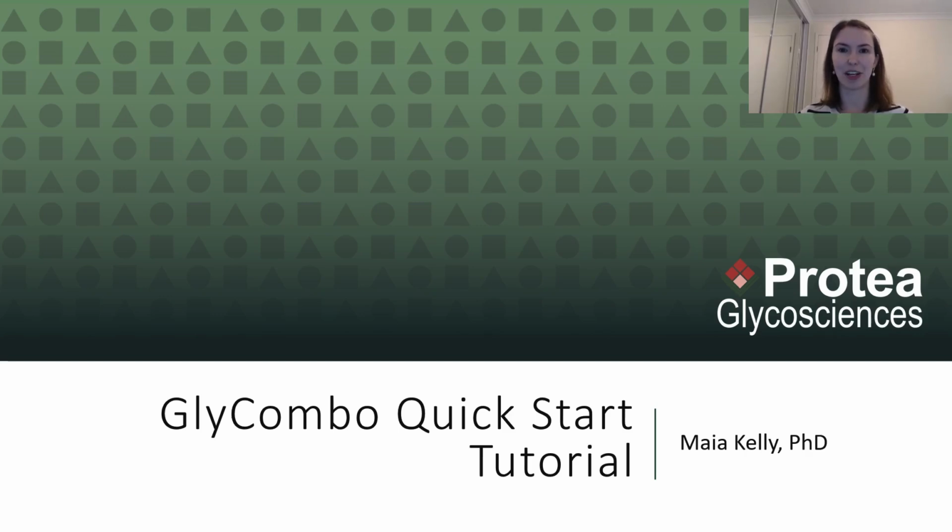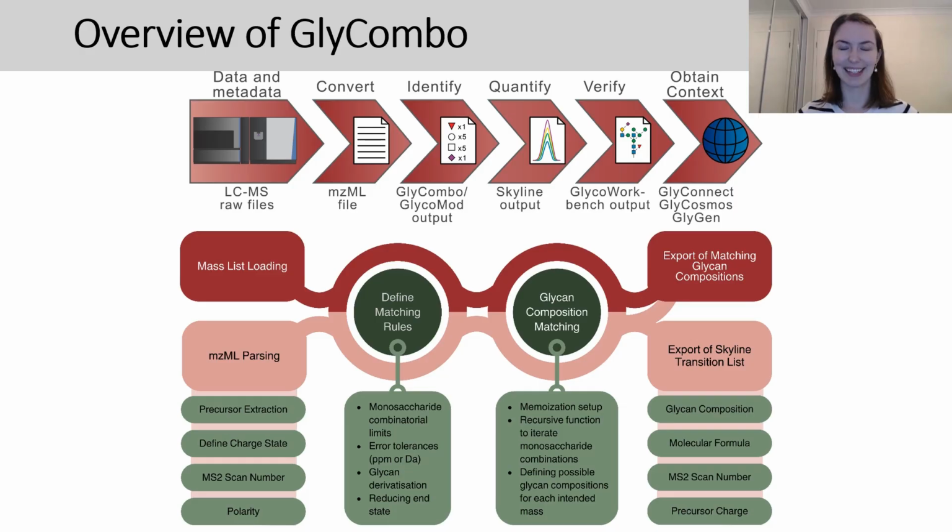Today I'm going to be talking about our recently published tool, GlyCombo. GlyCombo is a freely available software tool that's able to rapidly assign monosaccharide compositions to glycan precursor masses. On this slide here, I have a bit of information about how GlyCombo fits into the overall workflow, as well as down at the bottom, I have some technical details on how GlyCombo works.